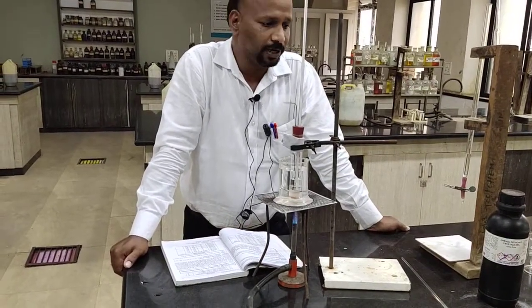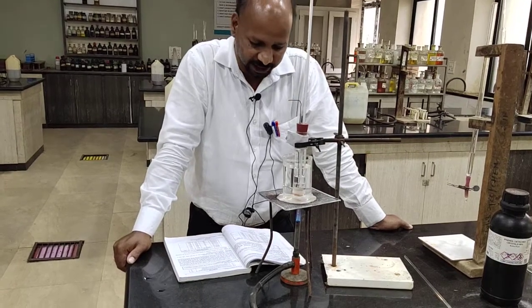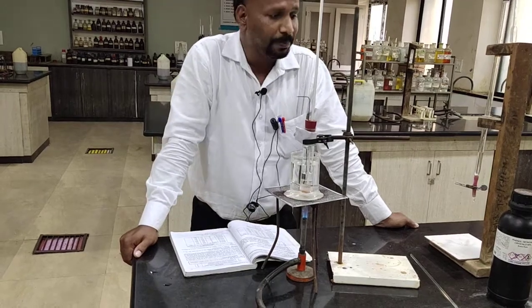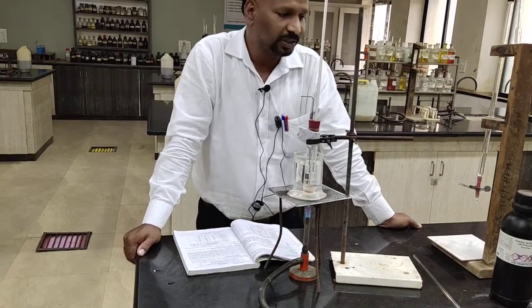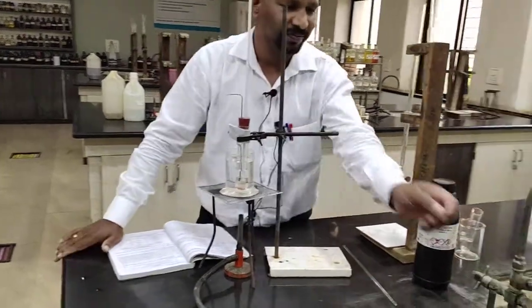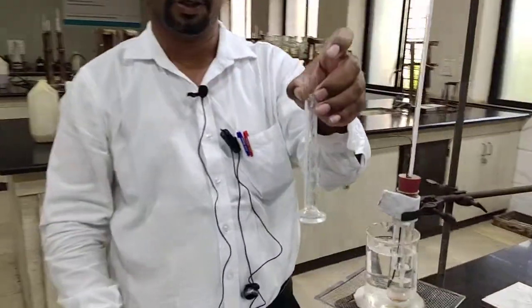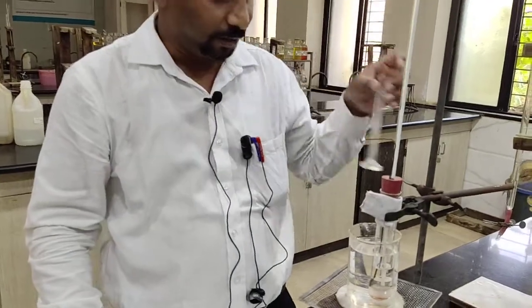So we are not going to pipette out the phenol. For measuring the phenol we are going to use a cylinder.